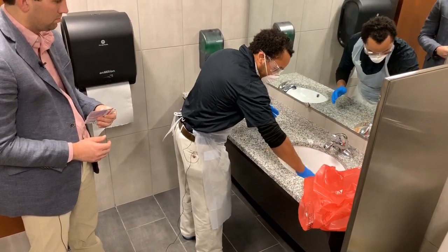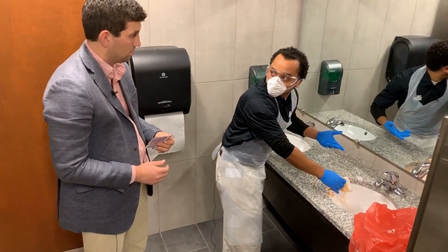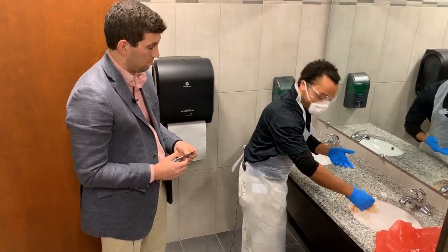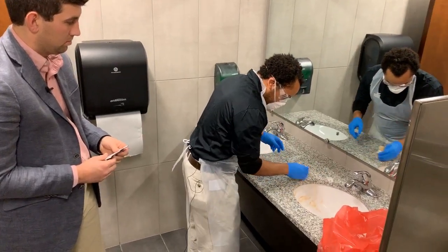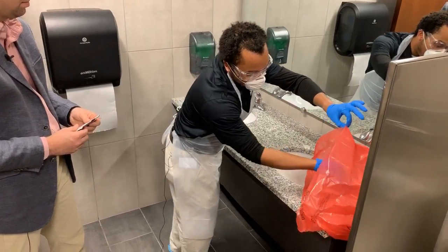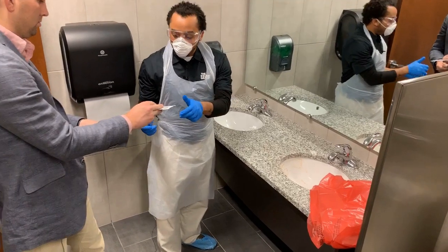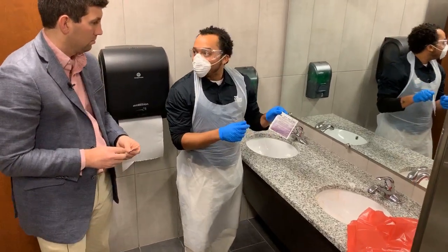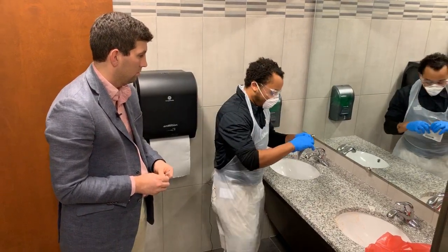You have to be very careful when you're wiping. You don't want to make any splatters because it could splatter on the ground and we just expand our surface area of cleaning. Okay, and then you put the contents in the red biohazard bag. And next you're going to hand me the germicidal wipes. So here, you need to let sit for 2 minutes, saturate the area or until air dry, okay?